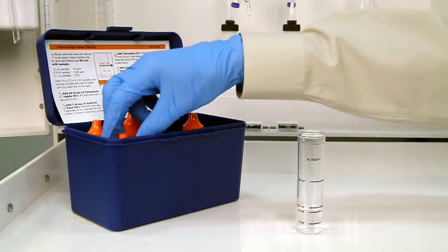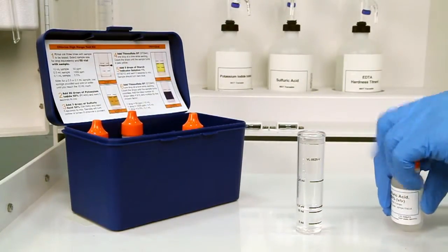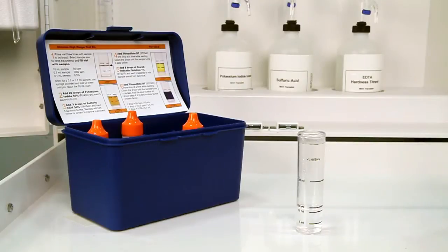The next step is to add three drops of sulfuric acid 50%. Remember to hold the bottle vertically to get a consistent drop size.